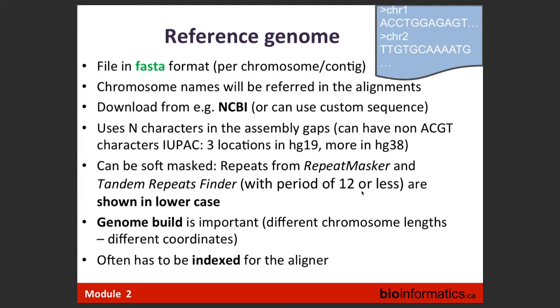Then also, if you look at the genome, the genome which we have for the lab contains letters in lowercase and uppercase. It's not necessarily always the case. Usually aligners are agnostic to upper and lowercase. But this is because repeats are masked, and those genomic sequences which are masked are in lowercase.